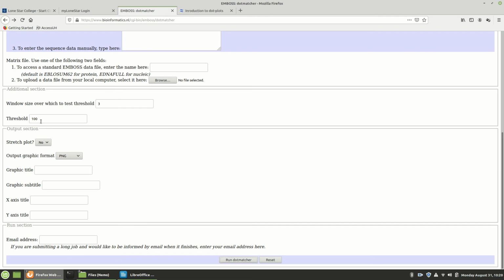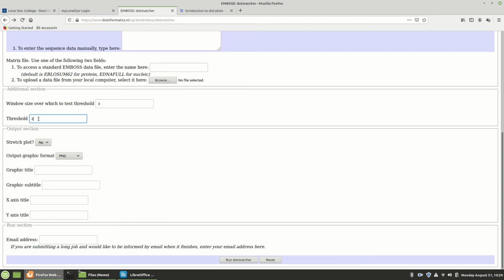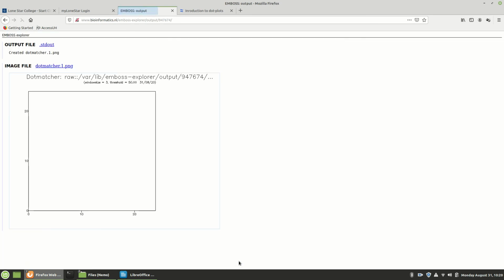Alright, maybe I go that way. Oh, yeah, let's do it that way. And maybe it just doesn't show the distinction. See what happens when you put in 50%. Nothing. Alright.